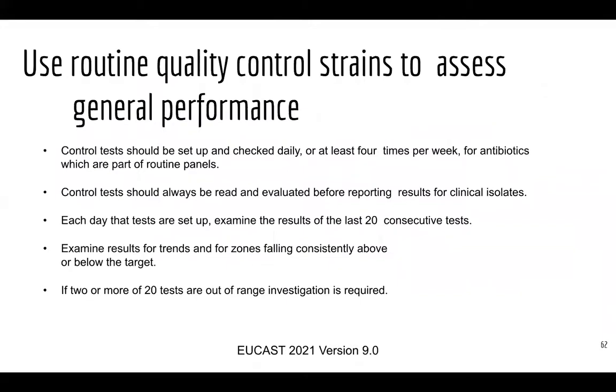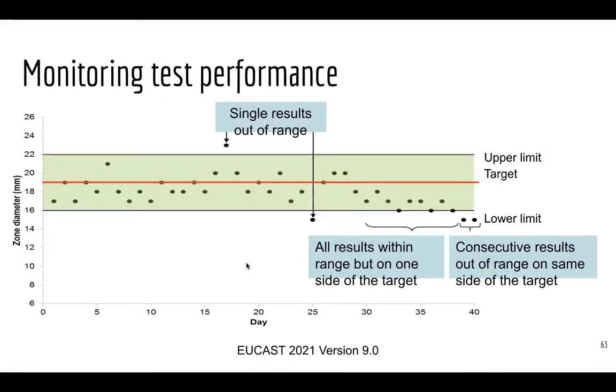So you can do control tests to make sure that your samples are still good over a long period of time as well. If you've been using a control strain for a few weeks, then you have to make sure you've got a consistent log of how often you're checking your control strains to see whether they're resistant, see if they're behaving the same, test them for different antibiotics, make sure that they're not accidentally introducing new mutations or anything from the environment. And you can monitor the results to see if it's out of range.